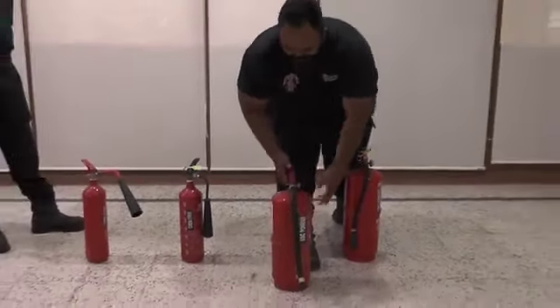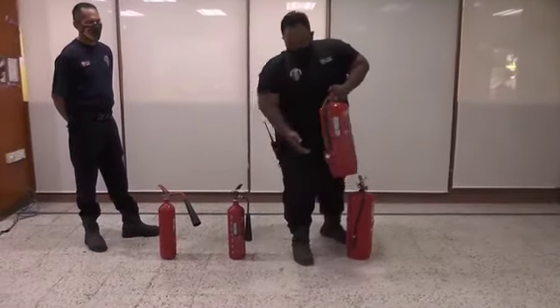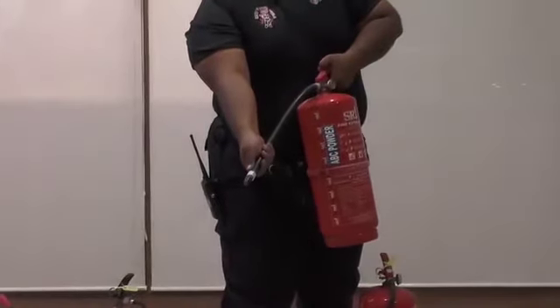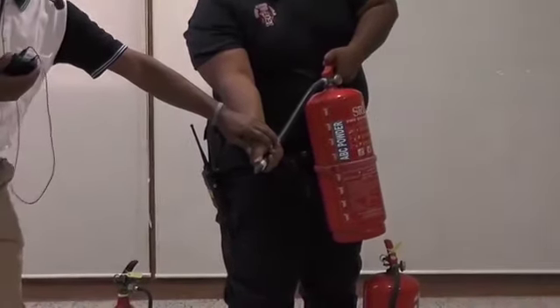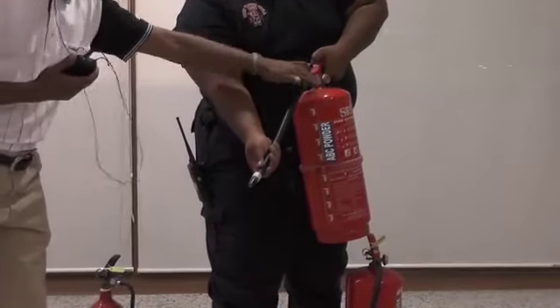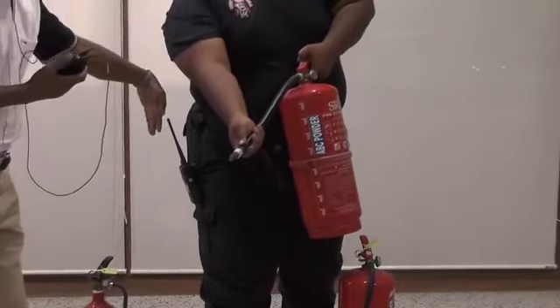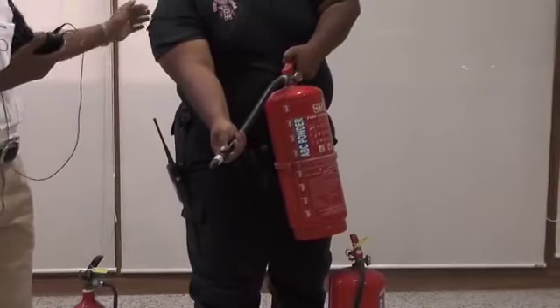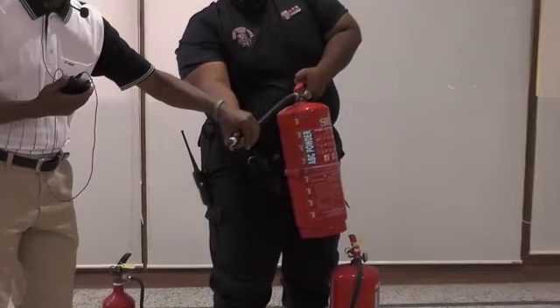Make sure when you want to use it, you hold it close towards the end of the hose. If you're holding with your left hand, the position of the cylinder has to be on the left side. Do not hold with the left hand and put the cylinder on the right side. Oh, it happens, and of course these people will laugh over it. Anyway, make sure you hold this very tightly.